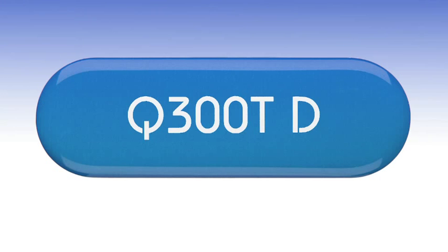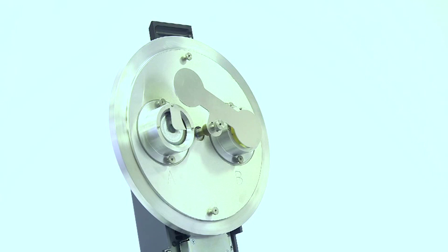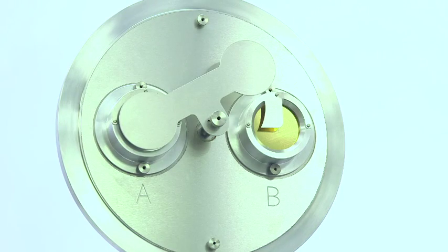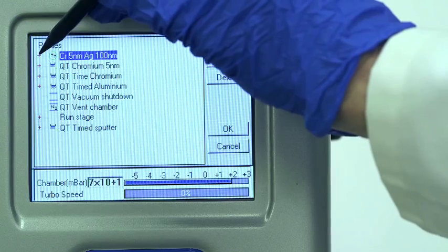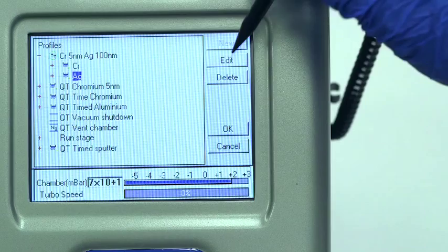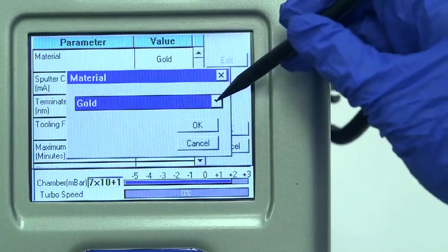The Q300TD completes the current Q-series range. Typically used for wafer coating and other thin film applications, it is a unique twin-target sputter coater for sequential coating of two different materials in a single cycle.